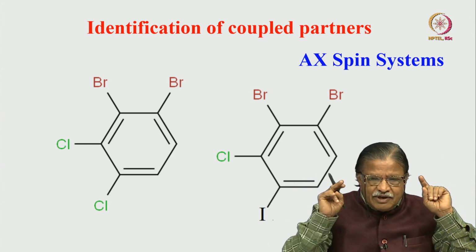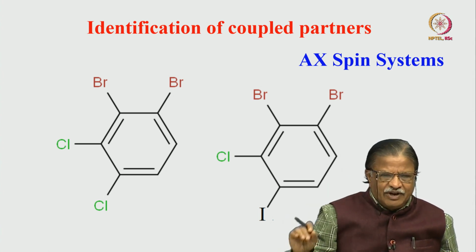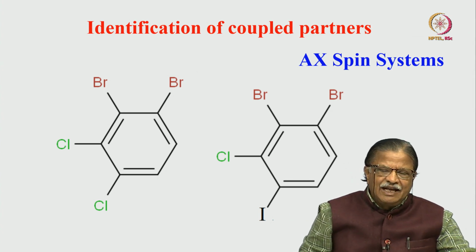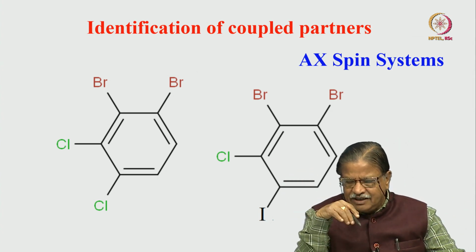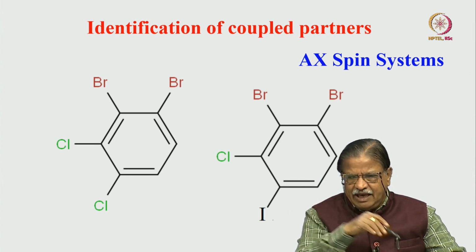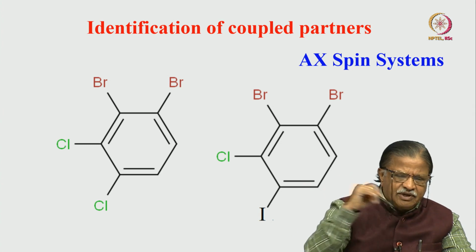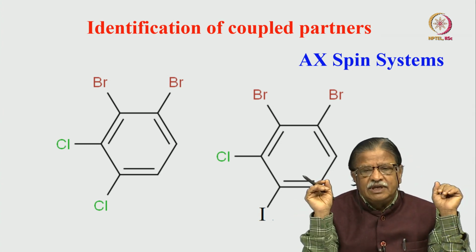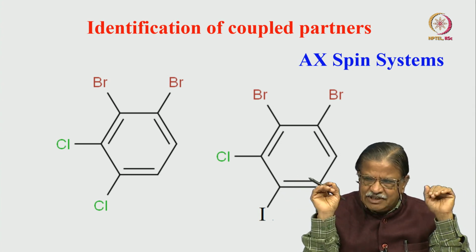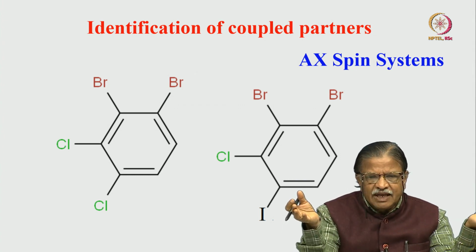And I explained to you, when we have 2 coupled spins, we have 4 diagonal peaks in a square pattern, 2 for A and 2 for X, and we also understood they are all autocorrelation peaks. The diagonal peaks correlate within themselves, and the cross peaks are the correlation of A and X. A gives its magnetization to X, giving rise to a cross peak. X gives magnetization to A, giving rise to a cross peak. Cross peaks are also 4 peaks in a square pattern, but the structures of diagonal and cross peaks are different. Diagonal peaks are both in-phase doublets in both dimensions. Cross peaks are anti-phase doublets in both dimensions. This is what we understood.